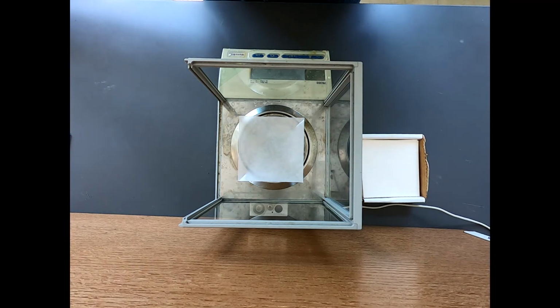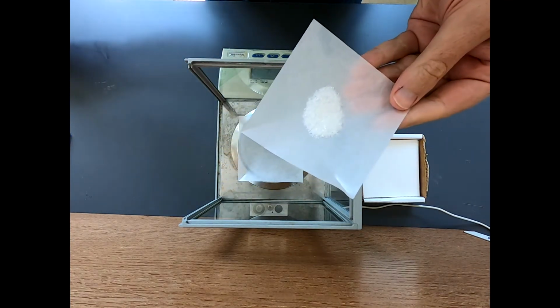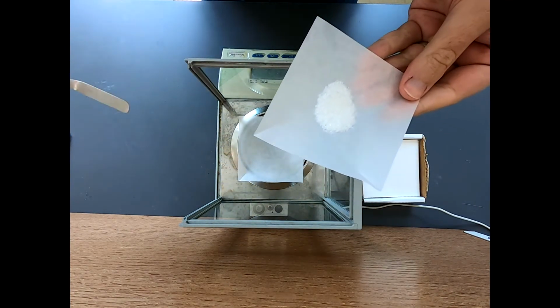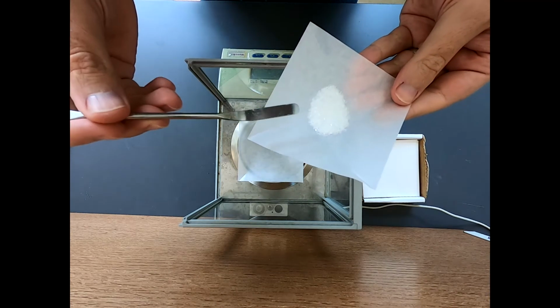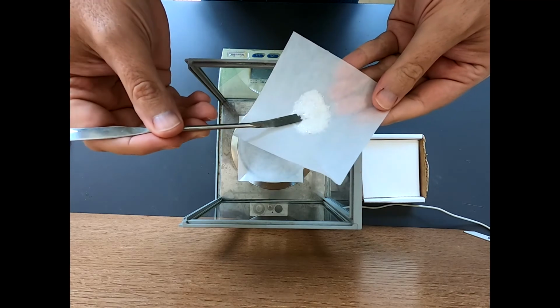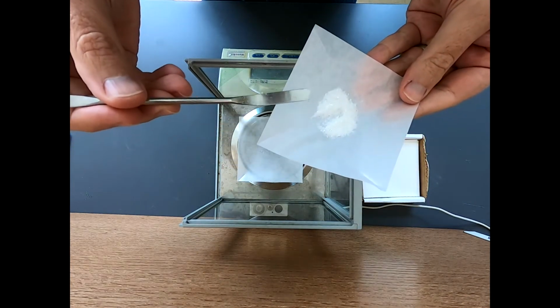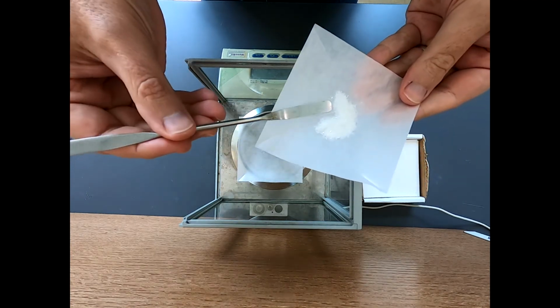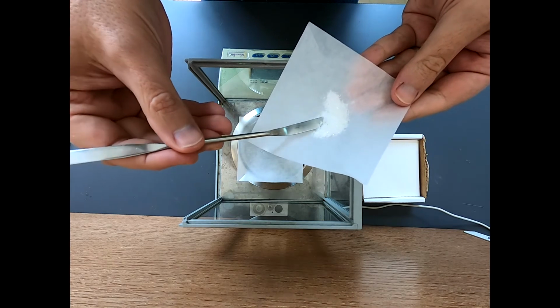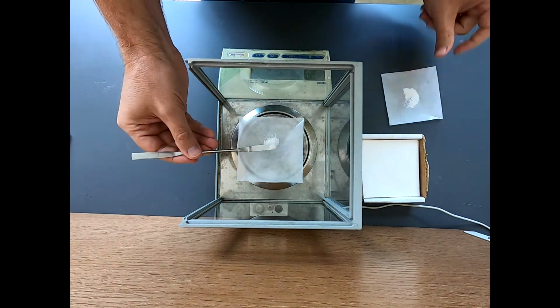Okay, so here I have on this piece of weighing paper a decent amount of the cycloadduct. And I'm going to go for about 1 millimole of the cycloadduct. That's about 190 milligrams. And so let's just see what we can get here. That's about 80. And this won't be exact, so I say about 1 millimole because that's what it's going to be.